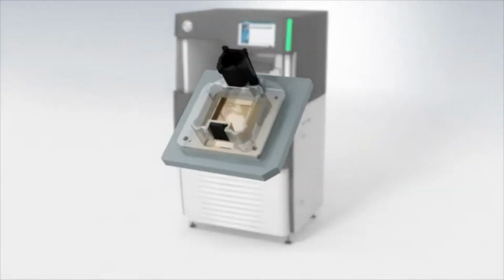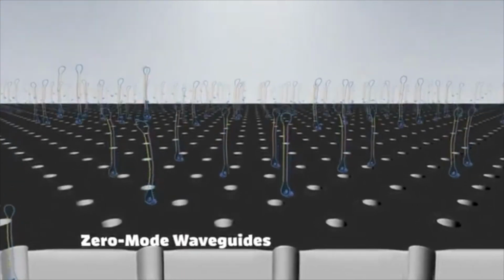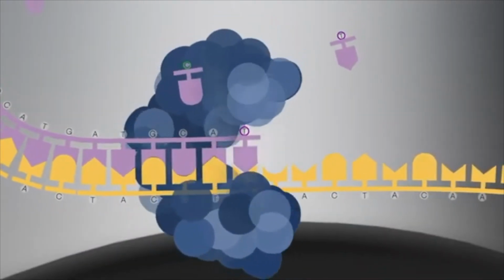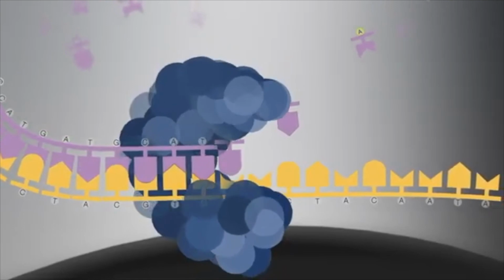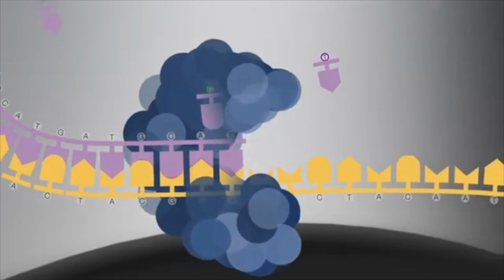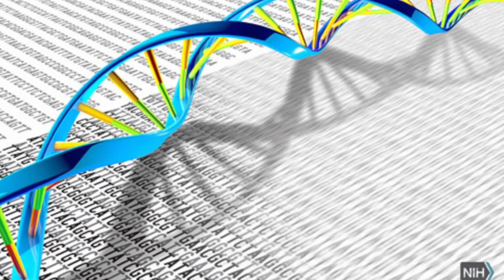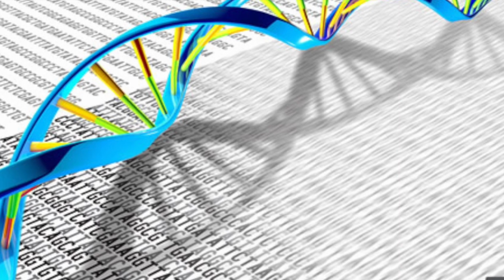At the core of the sequencing machine, we have the SMRT cell, which contains millions of tiny wells called zero-mode waveguides, or ZMWs. This is where the single DNA molecules will be isolated and start a replication process with the help of a DNA polymerase. As the polymerase works on the replication process, a different wavelength will be transmitted to distinguish each nucleotide that has been added, and that signal is registered in the machine to uncover the DNA sequence. This process has an accuracy of 99% due to the millions and millions of DNA molecules that are being analyzed at the same time.